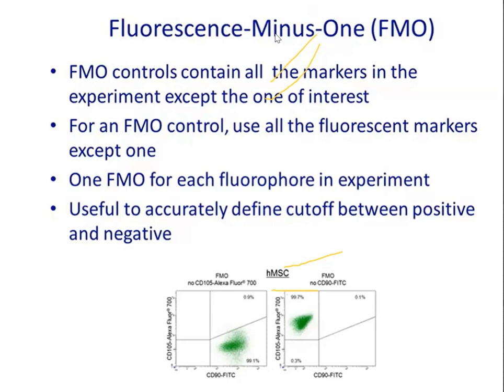Because all antibodies are nothing but immunoglobulins. So when you add antibodies, they will go and stick to the beads which have anti-kappa molecules on the surface, whereas the other bead, which does not have anything, will not bind. So when you run this mixture of beads in the flow cytometer, you get a negative population as well as a positive population. And remember, you are using only one fluorochrome in that bead.